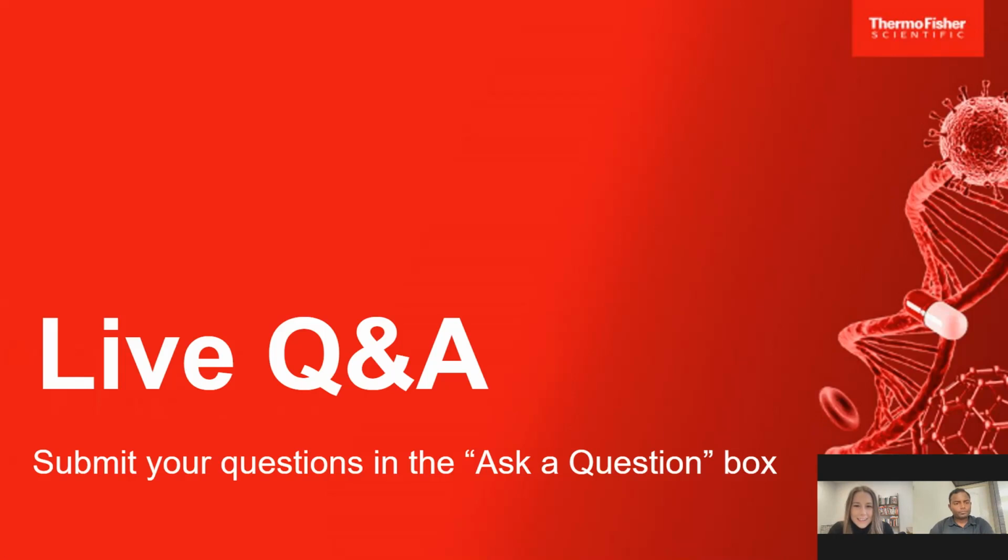Thank you. Another question here is: how do we image cells with different hanging heights in cell culture inserts, and will it affect the focus and resolution? Yeah, that's a good question. That's an important question as well, because while you image at different heights, definitely it will affect your focus and resolution.